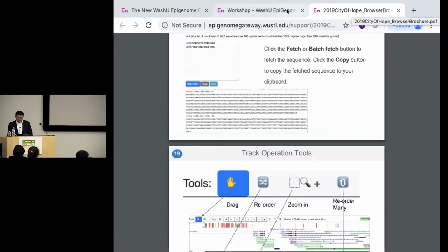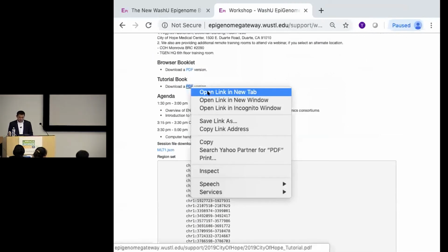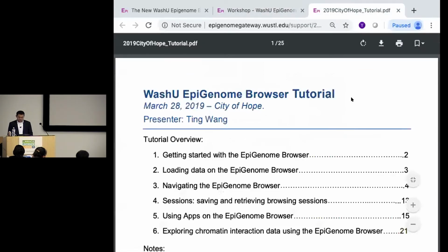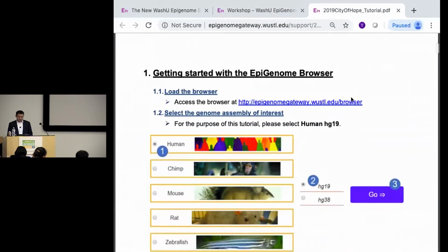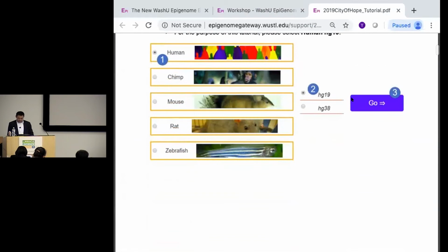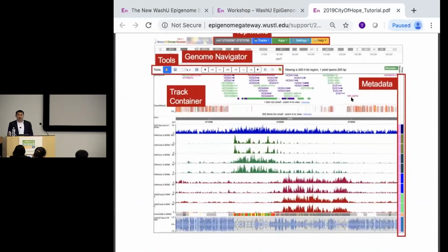So I'm going to close this. The second PDF is for today. This describes everything I'm going to demo. I probably won't remember all of them, so I printed out the versions. I'm going to go through this with you. I'm probably going to skip some, I'm probably going to forget some, but this is what I prepared for today.